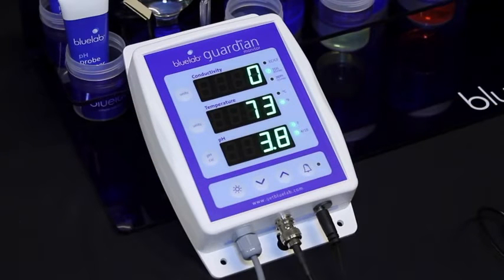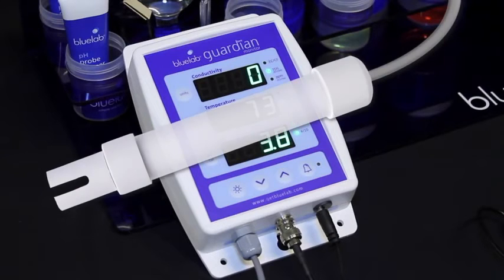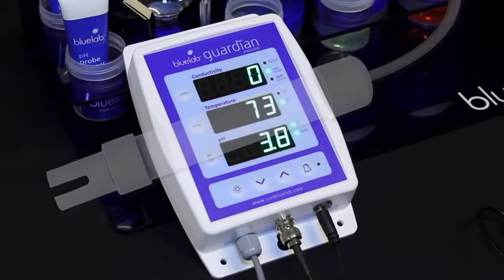Clean and calibrate the pH probe once a month to ensure accurate readings. The calibration indicators will flash or disappear one month after the last successful calibration to remind you it's time to calibrate again. Your conductivity temperature probe is factory calibrated so it is ready to use. You'll need to clean and test it once a month to ensure accurate readings.